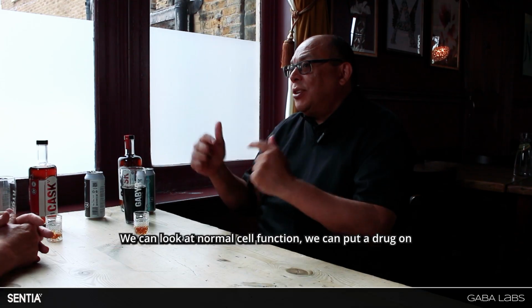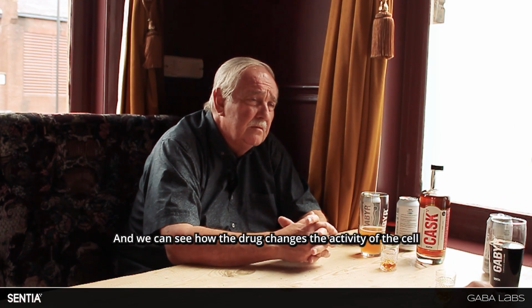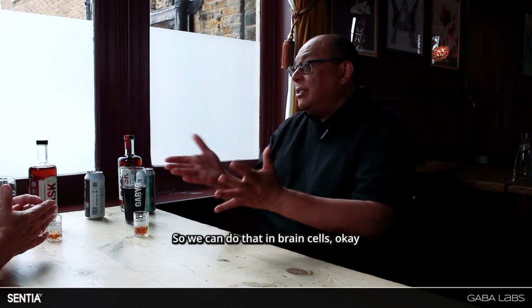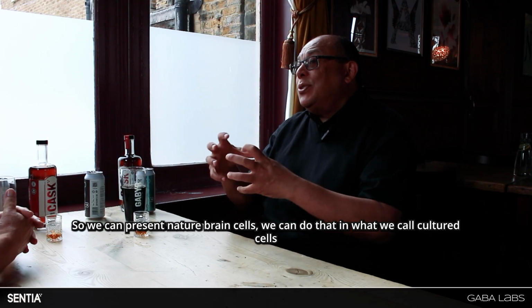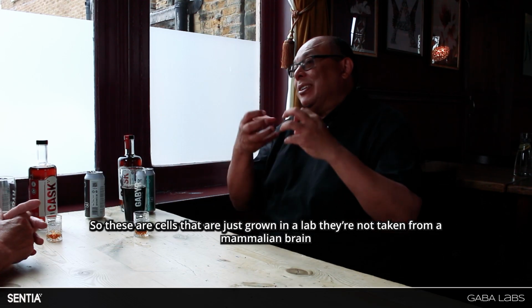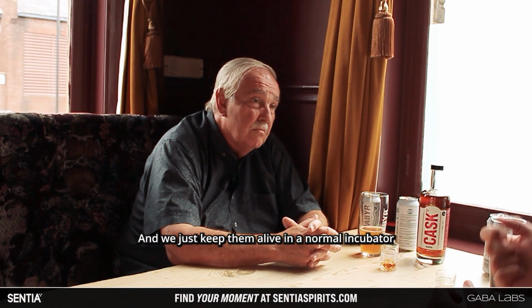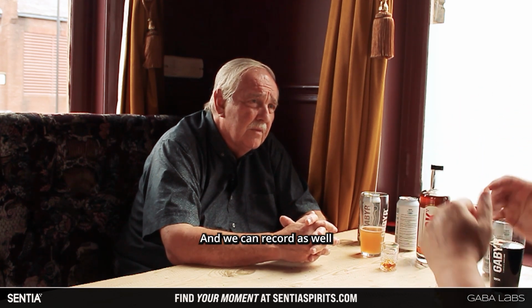We can look at normal cell function. We can put a drug on, and we can see how the drug changes the activity of the cell. So we can do that in brain cells, in native brain cells. We can do that in what we call cultured cells. So these are cells that are just grown in a lab. They're not taken from a mammalian brain. And we just keep them alive in a normal incubator, and we can record as well.